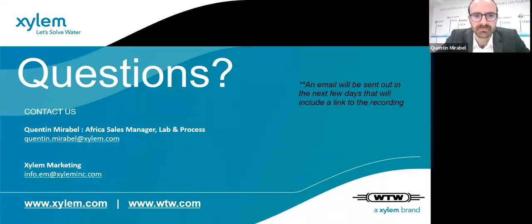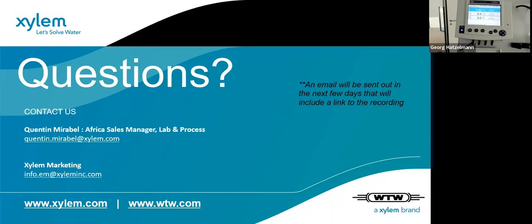Yeah. A question about ultrasonic cleaning: is the ultrasonic cleaning off when the sample reading is stable, or increased during sample flow off? I'm not sure if I understand the question. I'm also not sure, but I can say a few words, maybe this answers it. The method we have is that at first we do ultrasonic cleaning for I think 7 or 10 seconds, and then we switch off the ultrasonic to make the measurement, so that the reading is stable and not interfered with by the ultrasonic.